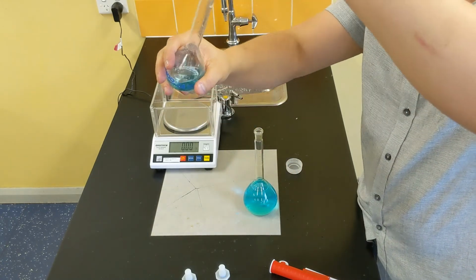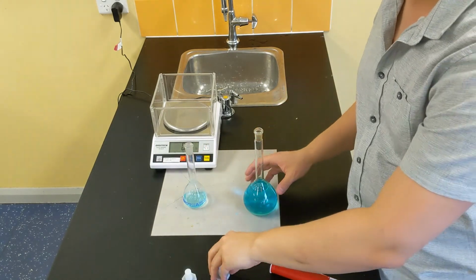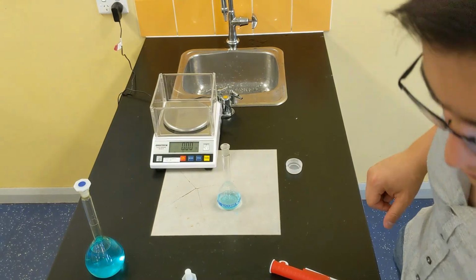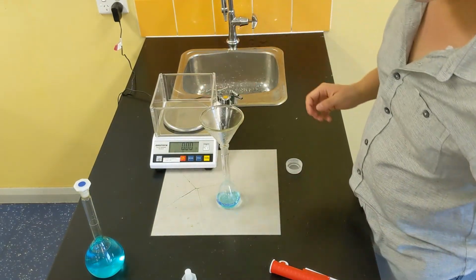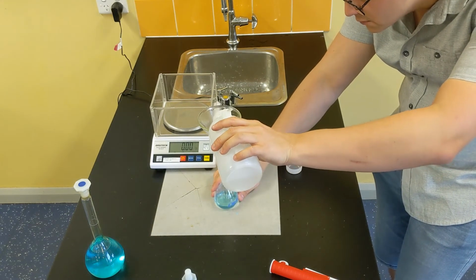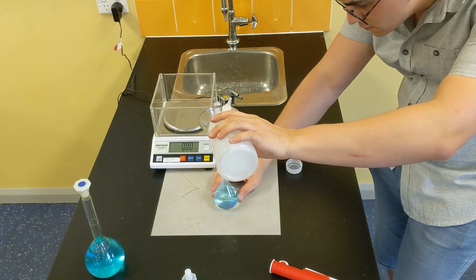So that's all filled. Notice as well that I cap the other flask in case I knock it over. And then I've put it away to the side. I've got my funnel again, and I'm just going to be adding water, not all the way up to the mark. We want it to be fairly close. I usually stop right before I get to the bottleneck inside the flask.